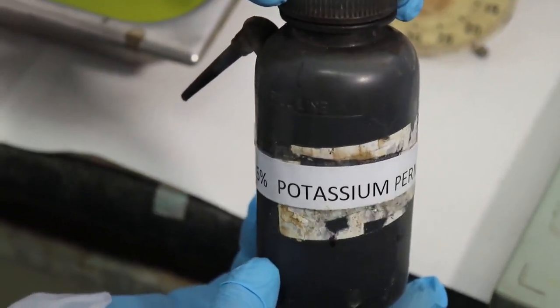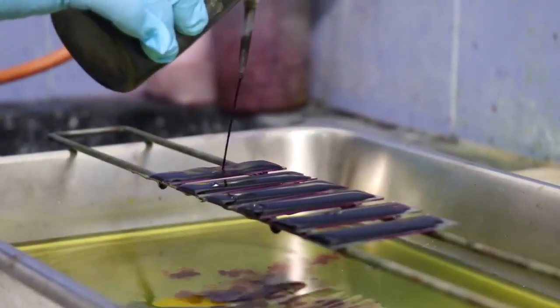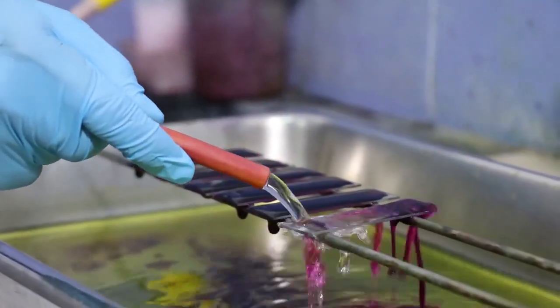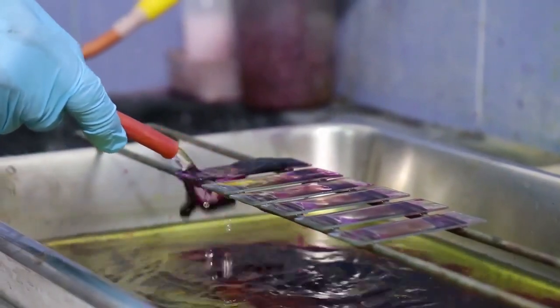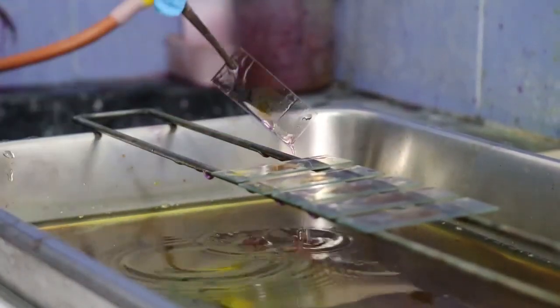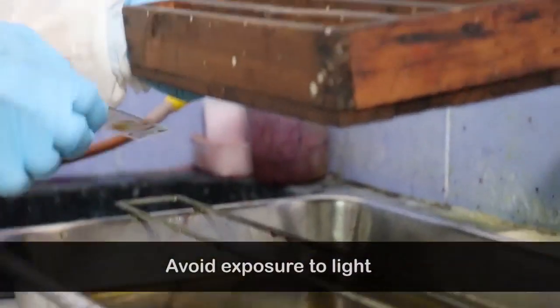Next, pour potassium permanganate onto the slides and leave it for 1 minute. Rinse gently with tap water. Tilt the slides to drain out water. Finally, air dry the slides, avoiding direct exposure to light.